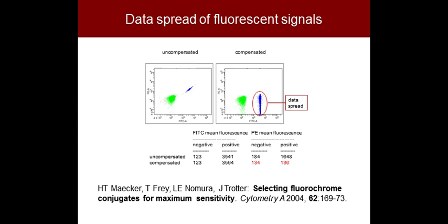It's definitely staining for FITC, but it also has PE fluorescence, even though there's no PE in these beads. So that's because of spillover. What do we do about it? We apply compensation. We measure from these single color compensation controls the amount of fluorescence in both FITC and PE, and we essentially apply a matrix that subtracts out the PE signal on average.